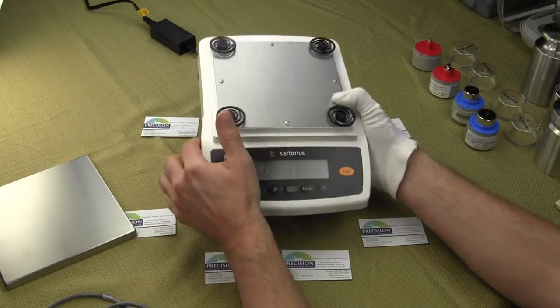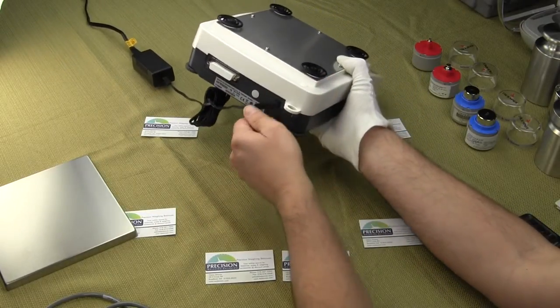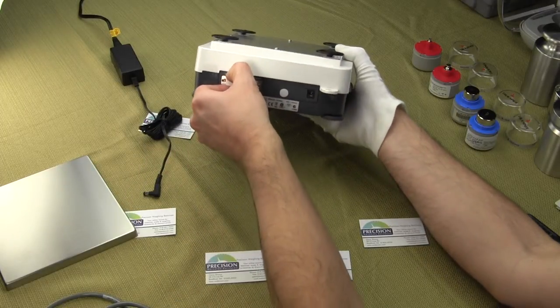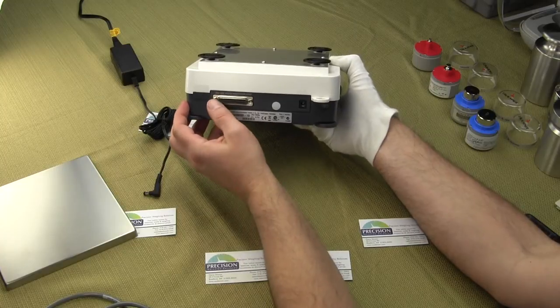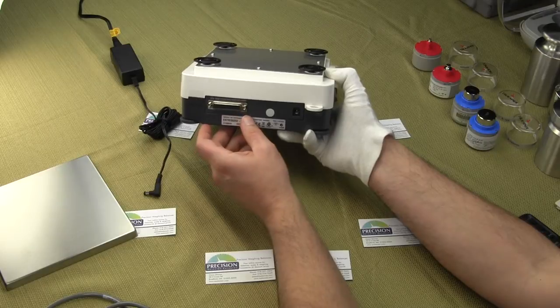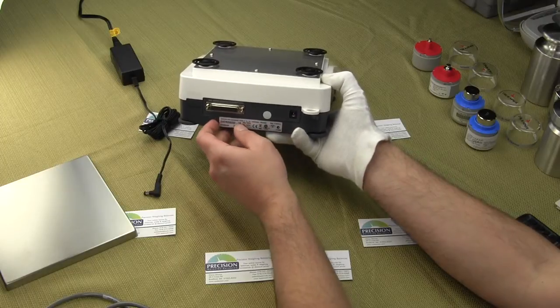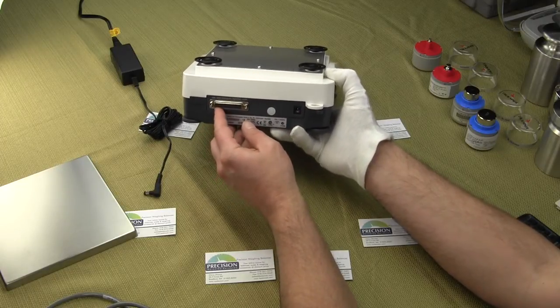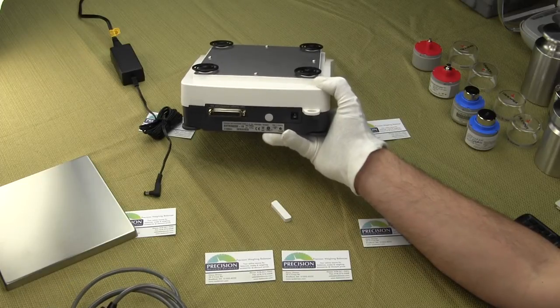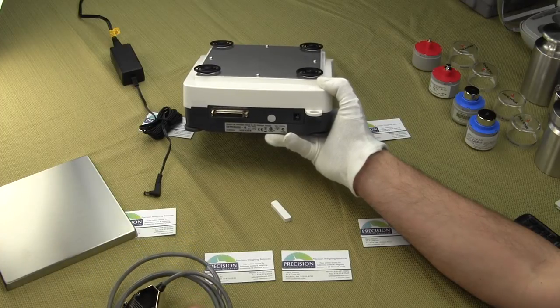The balance comes with an AC power adapter. You also have a Serial 25-pin port on the back of the balance. This Serial 25 would be used if you wanted to connect this to a Sartorius printer, which is optional. Or if you wanted to send data to a computer, you'd have to have the software. We do sell and recommend TAL's WinWedge software.